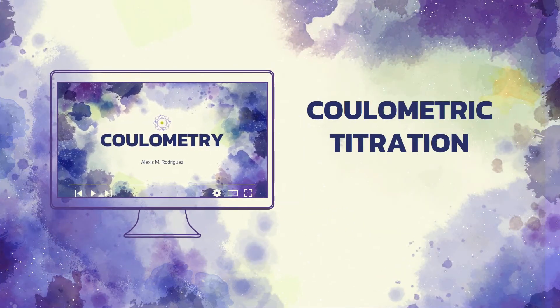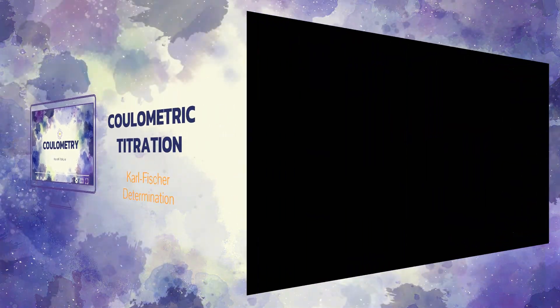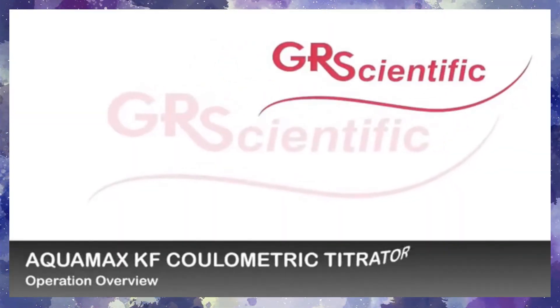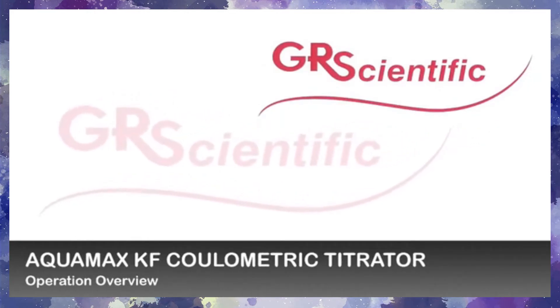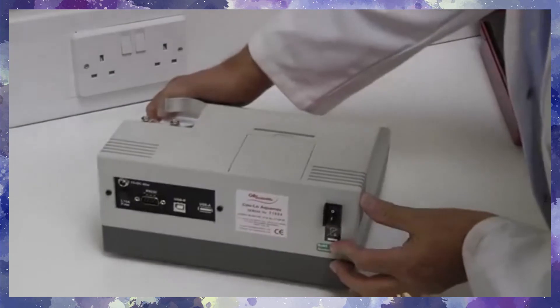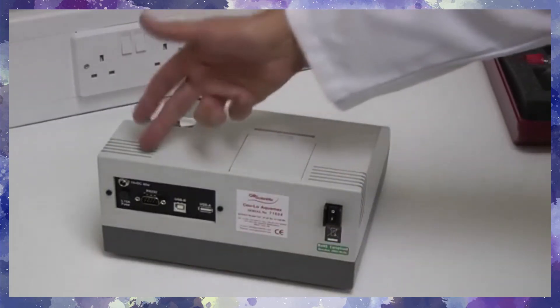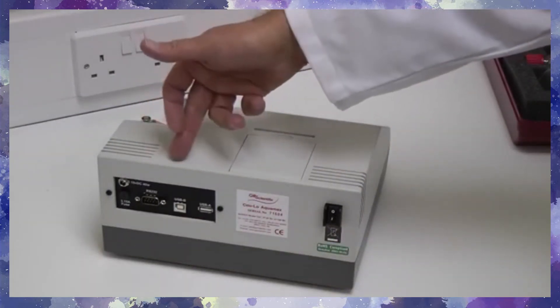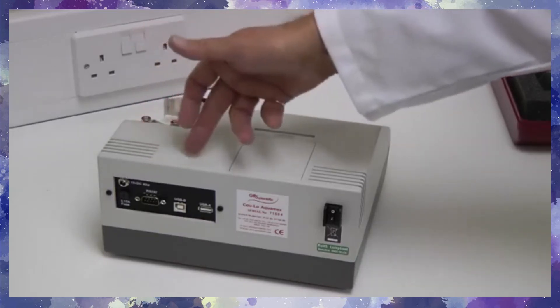Here is a short video involving the use of coulometry, specifically coulometric titration, in the determination of water or moisture in liquid samples using Karl Fischer titration. At the rear of the unit are the power switch, the power inlet, the fuses, and the RS-232 and USB connections.